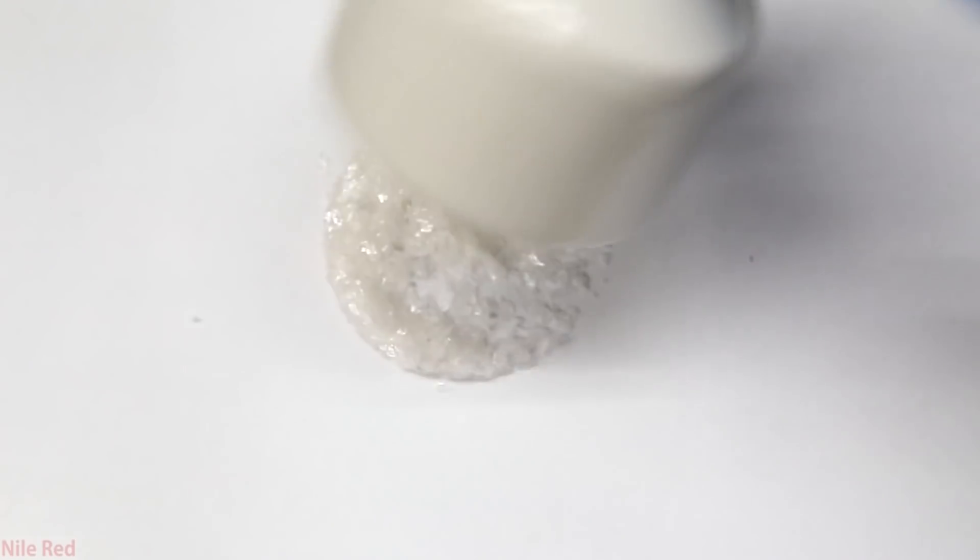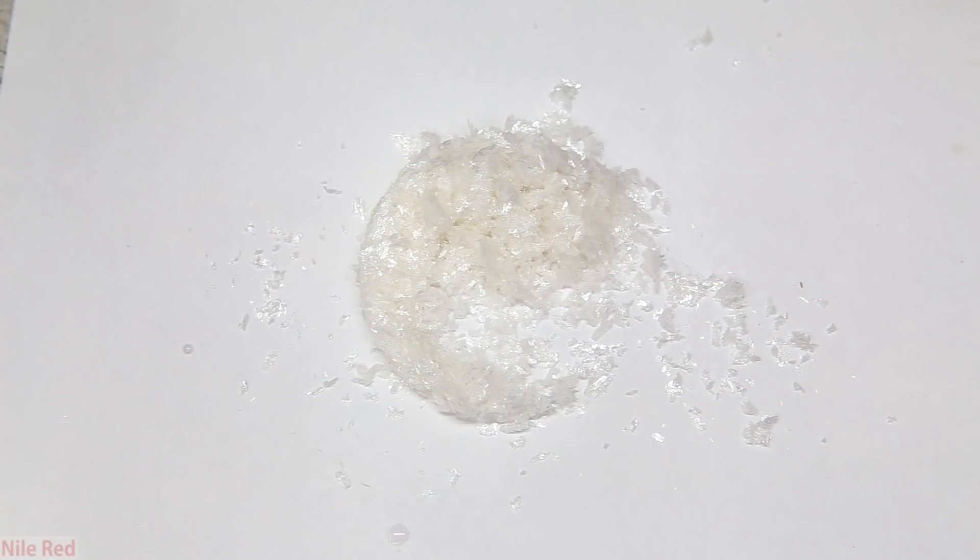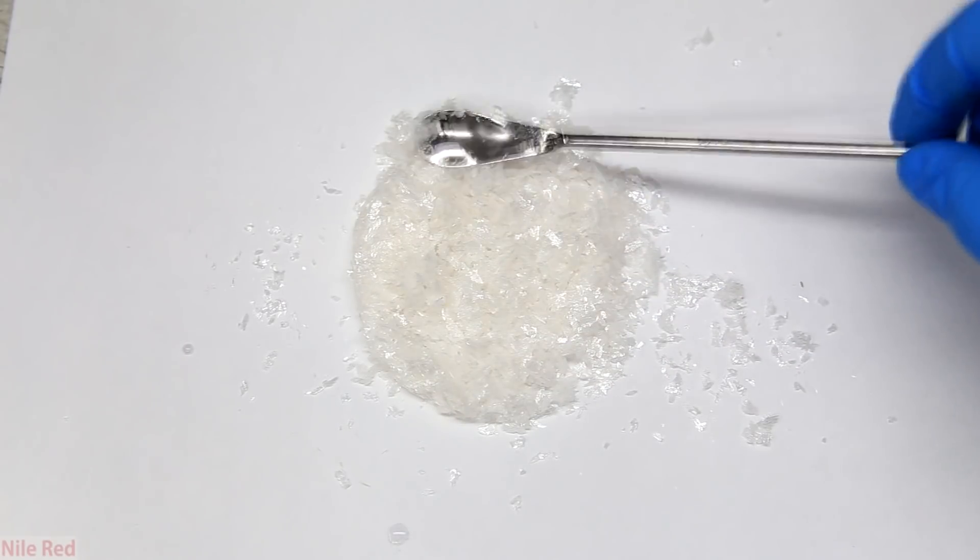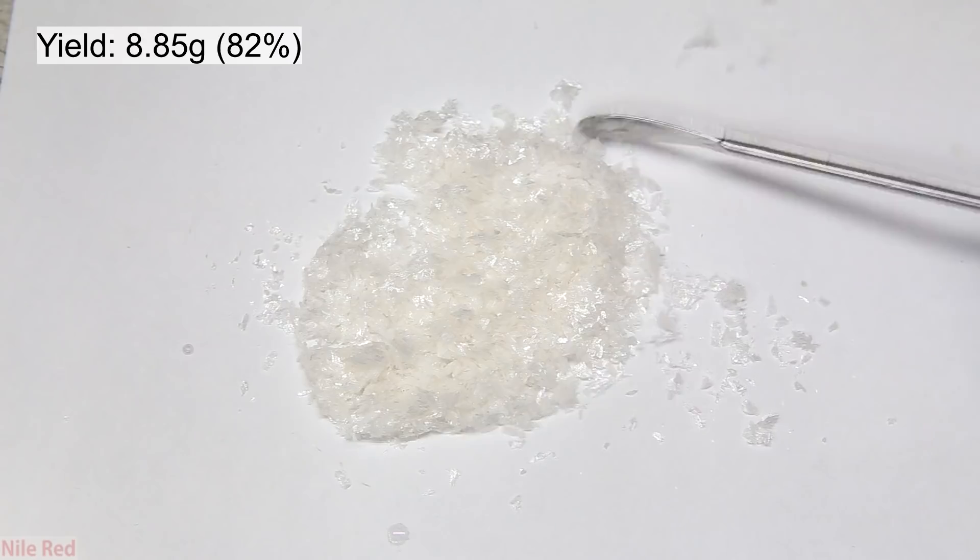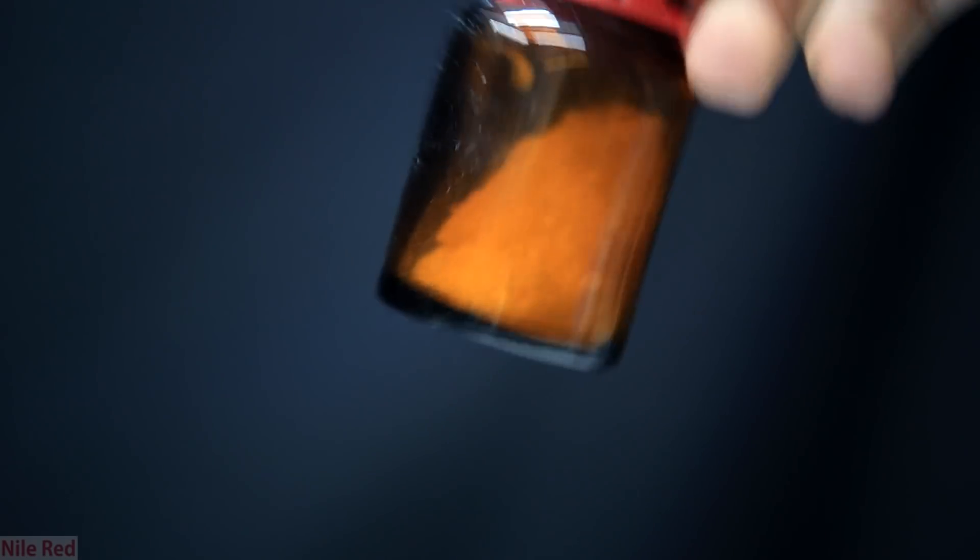The contents of the Buchner funnel are then dumped onto a white piece of paper. You can see here that we have some fairly nice slightly off-white crystals of vanillin oxime. The final yield of vanillin oxime is 8.85 grams which represents a percent yield of about 82 percent. The vanillin crystals are then transferred to a small bottle for storage.